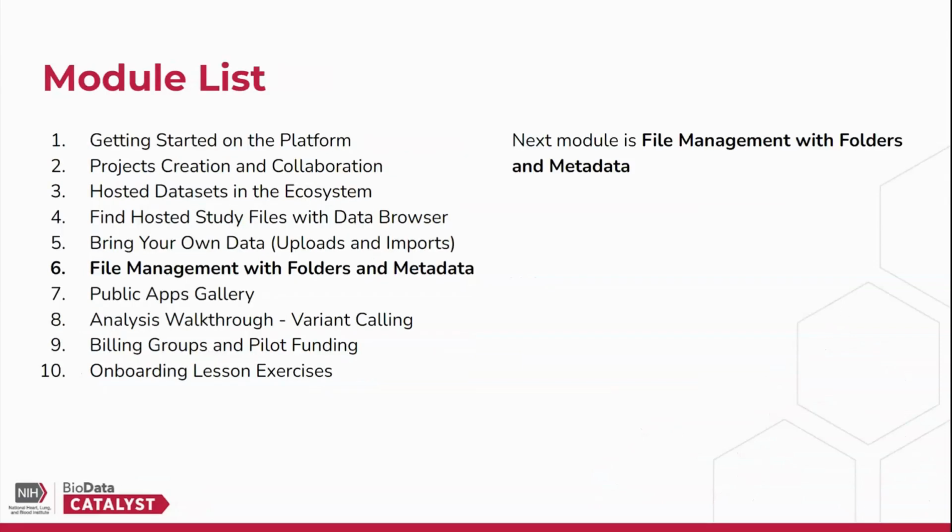This concludes the video on bringing your own data. The next suggested video in the onboarding playlist is called the File Management with Folders and Metadata video. There you will learn how to organize the files that were either linked using Data Browser or imported using one of the BYOD methods described here.